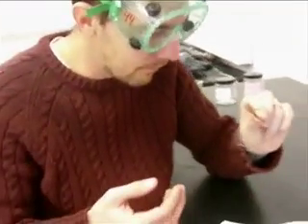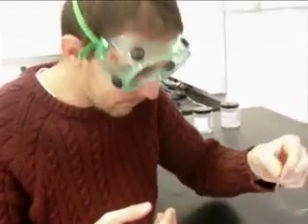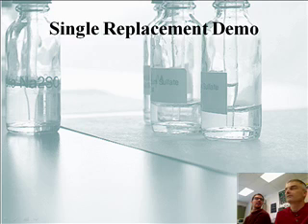It's why silver nitrate is so expensive, because it has actual silver in it. So you have it. Single replacement. And we forgot to finish this one, actually. That was pretty cool. So you got just silver. Actual silver coming out of a solution.